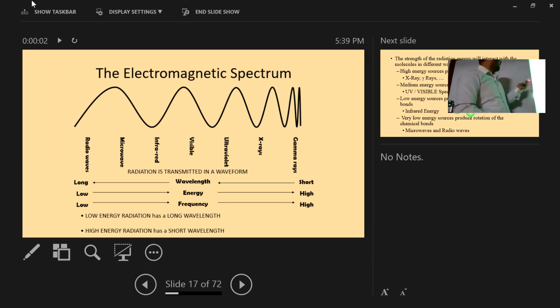So if we use this type of combination, we can make multi-photon absorption. The laser intensity can be increased quite a lot, so the molecule can absorb many photons at the same time. I have given just a single shot, but we set up in such a way that the laser intensity is very high, so it can absorb many photons at the same time.